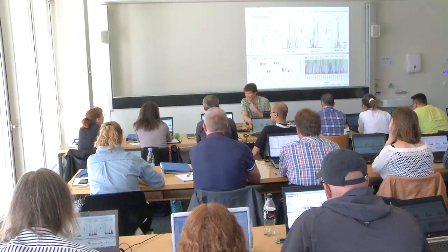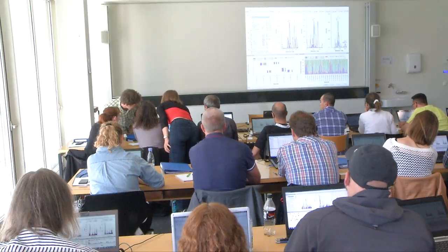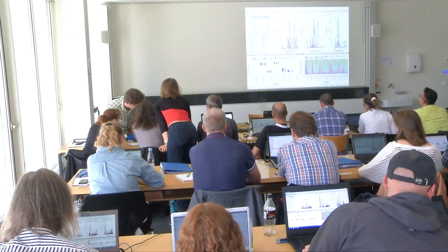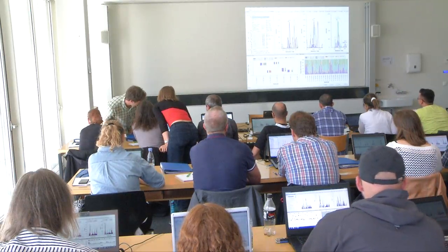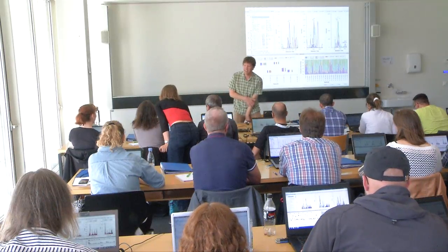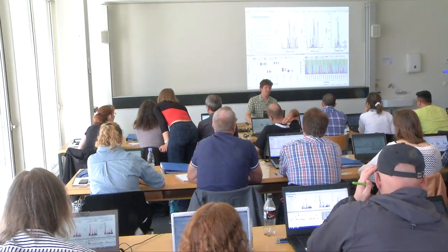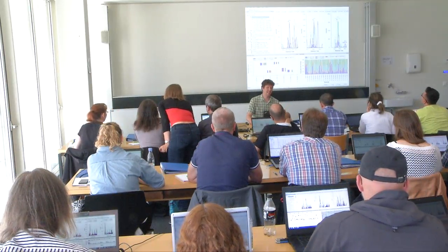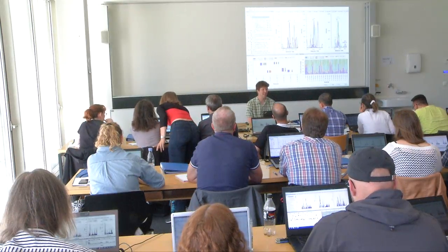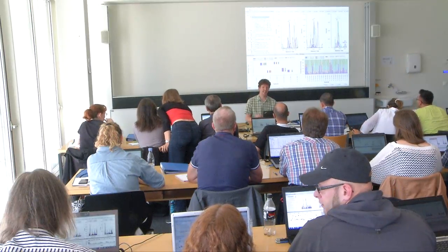Are you looking at GILAD, the peptide GILAD? You don't have a library. Oh yeah, that'll do it. So if you remove the library, that will do it. So yeah, this dot product, what is the dot product a comparison of? Does anybody know what dot P is a comparison of? Yeah, to this reference spectrum.